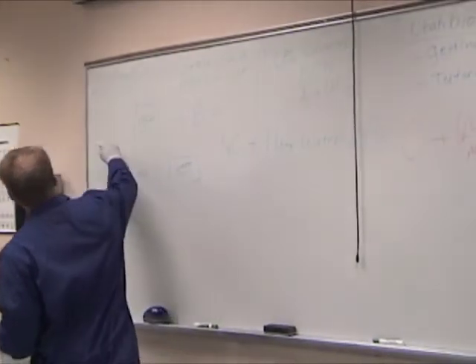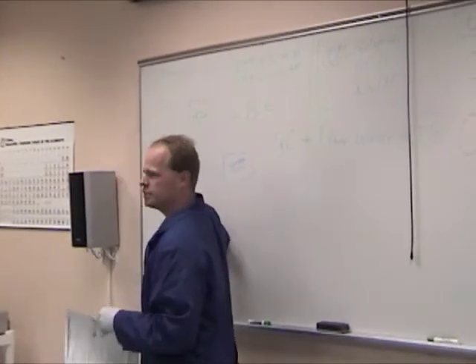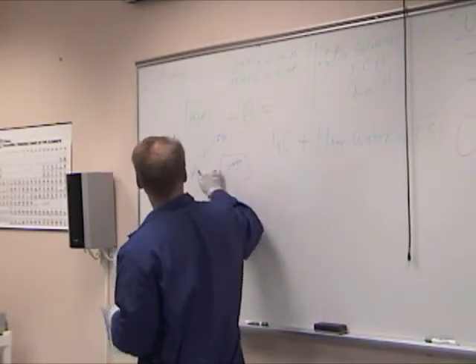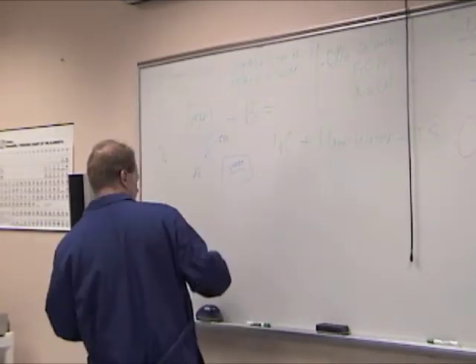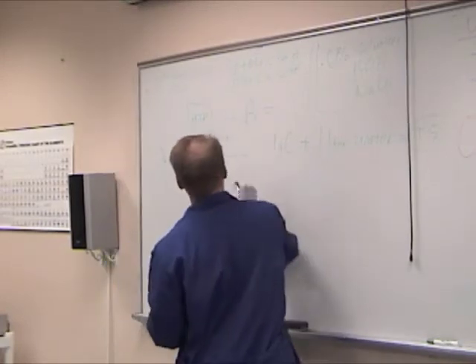Okay, so I'm going to pour some of the stuff I've made right here into my titration solution cup. I'm going to pour some isopropyl alcohol into one cup. This will just be my waste. Then I'm going to need actually 4 cups, I'm sorry. This is where I'll actually do my titration.